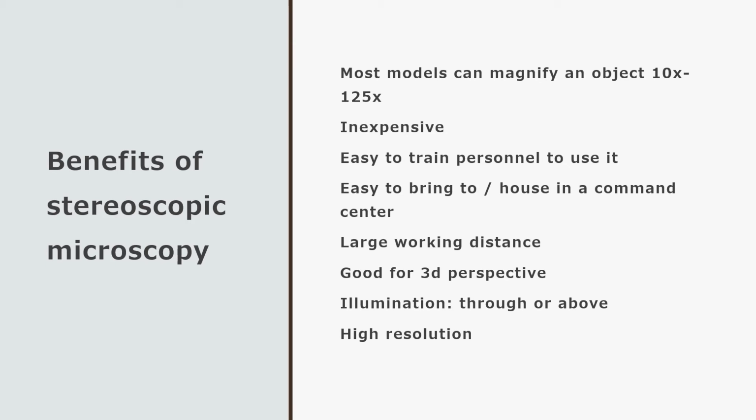On a compound microscope, you have to mount everything on a slide, right? So it has to be a very thin kind of a thing to fit on that piece of glass to look at through the lens. Here, you can chuck all kinds of things up onto it as long as it fits between the lens and the stage, and you can put like most of your fist in between that distance when it's at 10x magnification and zoom back. You can see quite a bit.